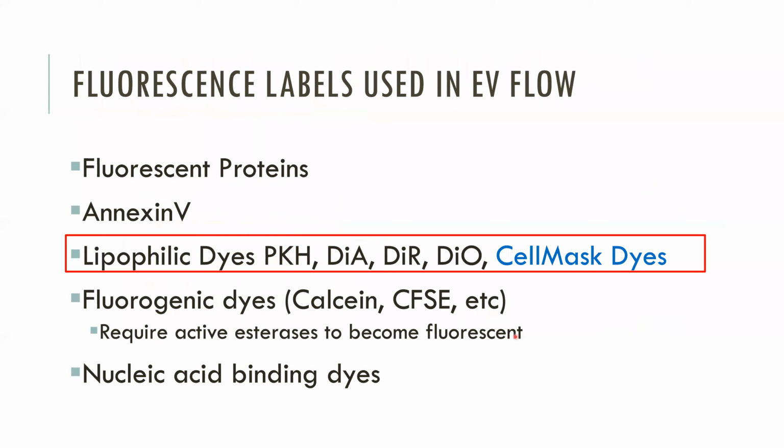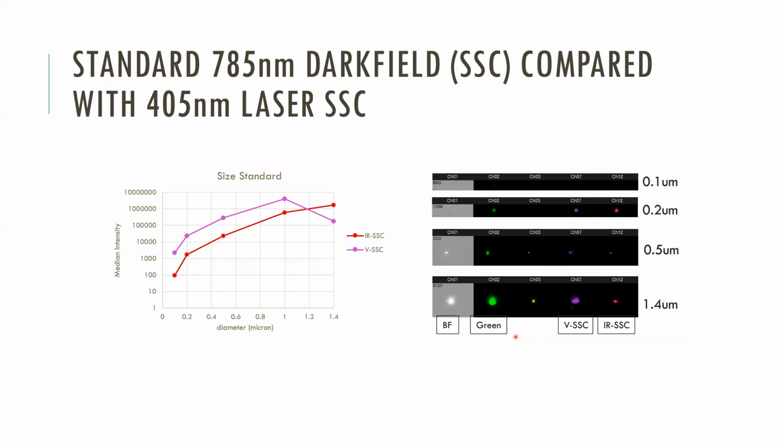We have a couple questions just out of curiosity. Some people are really interested in the baseline, discriminating these from background and comparing the CCD camera versus the PMT. So it's hard to make a direct comparison other than that the CCD has a wider range, a much longer linear range than the PMT. And we definitely find differences in sensitivity, particularly toward the red end of the spectrum. I know that AMNIS claims that they have better sensitivity down into the green area of the spectrum. I don't know that I've seen that experimentally tested, and corporate literature is what it is, right?